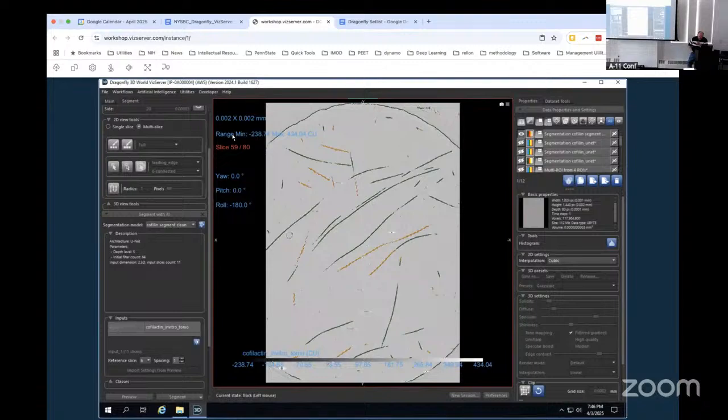You're right though, in that we will retrain and then we'll be like, oh, that looks really good, and we'll go to another tomogram that it used to work well on and it doesn't work so well anymore. And so we'll be like, okay, well, we definitely need some of that data, and so we'll pull it in. And there does seem to be some threshold at which you just have enough data and it's kind of good at seeing most things.